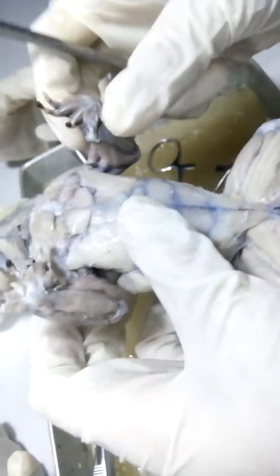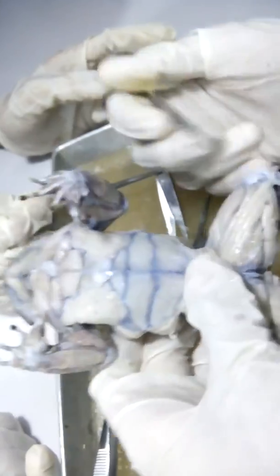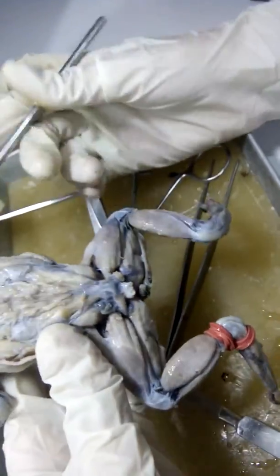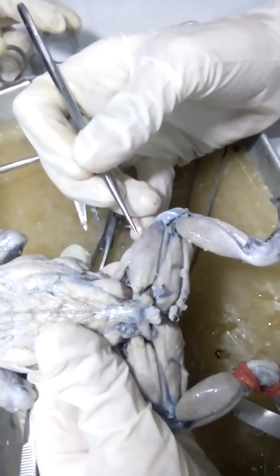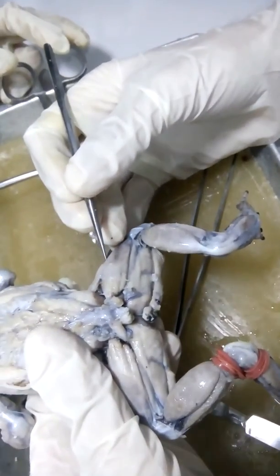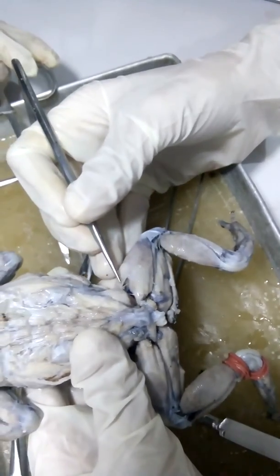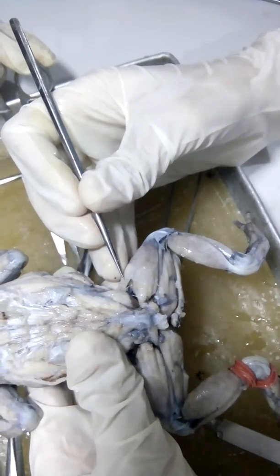Okay, so now we're done with the major main body mass. So let's proceed to your appendages. So let's start with the dorsal portion of your hind limbs. So this right here is your triceps femoris. So triceps from the word meaning three heads. So we can see here from the dorsal side, we can only see two heads. So this would be your RFA.